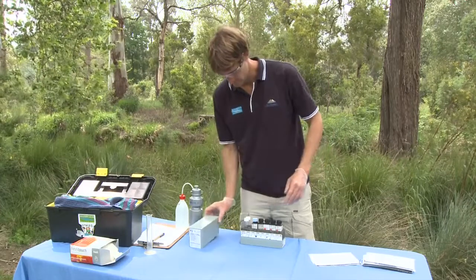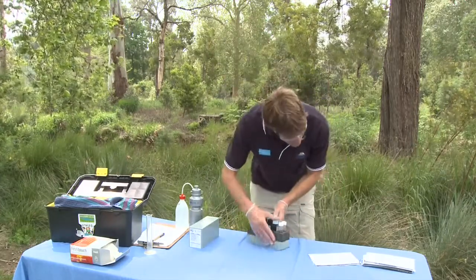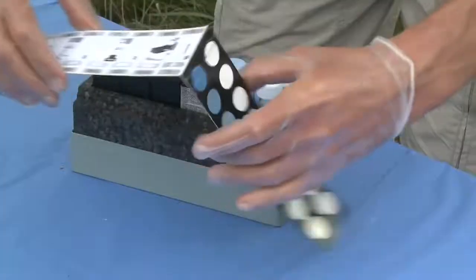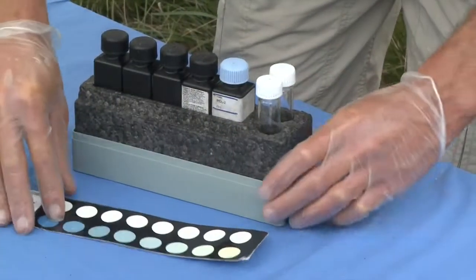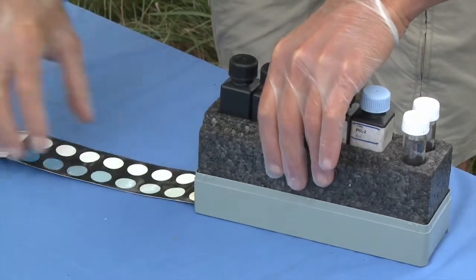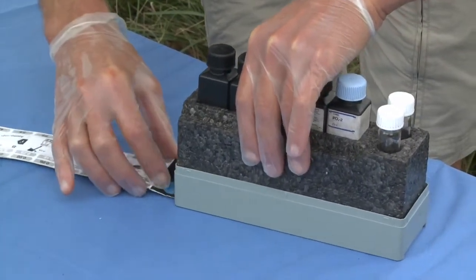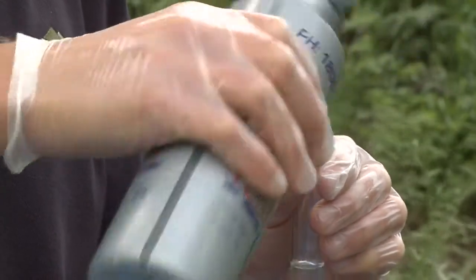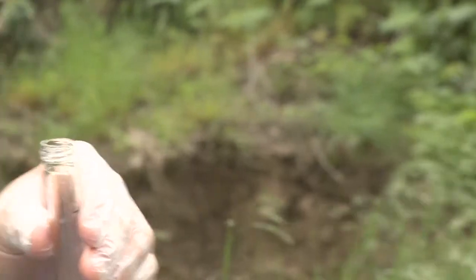Measuring Reactive Phosphorus, Step 1: Open the pack and set up with both tubes on your left. Step 2: Unfold the colour card and introduce it into the slit at the lower right-hand end of the plastic box. Rinse the test tubes with the sample three times and fill them to the 20mm mark.